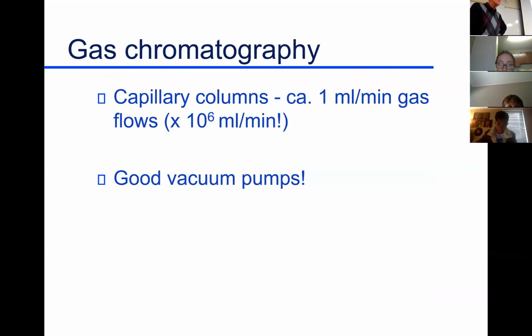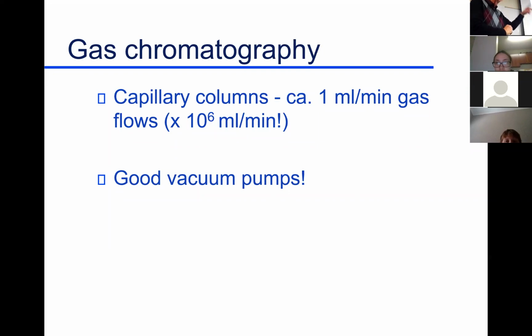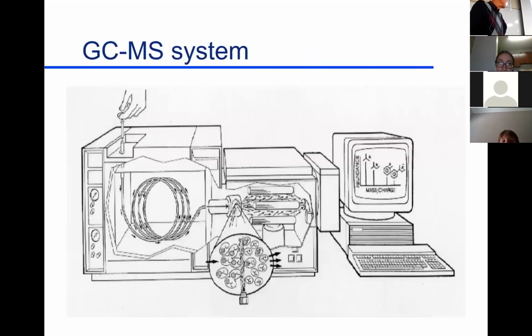It's fascinating to me and maybe somewhat irrelevant, but we have these turbo pumps, and we've got machines that turn about 55,000 RPM. That rotor inside is rotating 55,000 RPM, and they've run over 30 years. So these pumps are really built well. They're very robust, and they have really good lifetimes. But good vacuum pumps are the heart of the system. If you don't have good vacuum, you don't have good data.